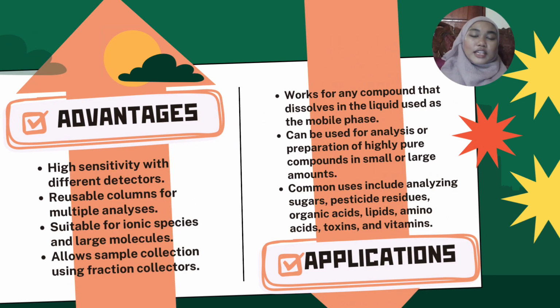There are many advantages of HPLC. HPLC has greater sensitivity due to its variety of detectors. It has a reusable column for multiple analyses and is suitable for ionic species and large molecules. It allows sample collection using fraction collectors.